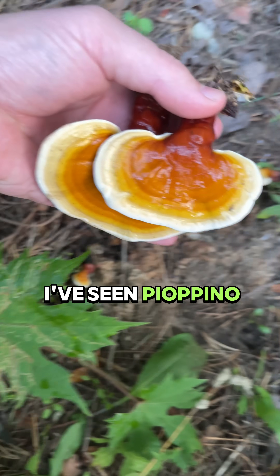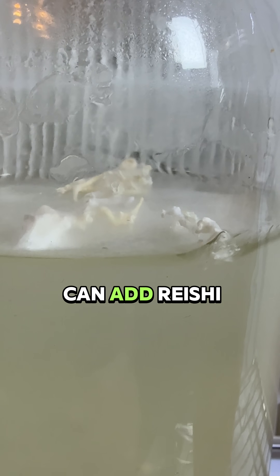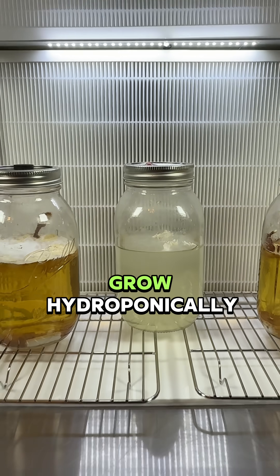I've seen pioppino and oyster mushrooms grow on the surface of a liquid culture, and now I can add reishi to that list. Let me know in the comments what other mushrooms you think could grow hydroponically.